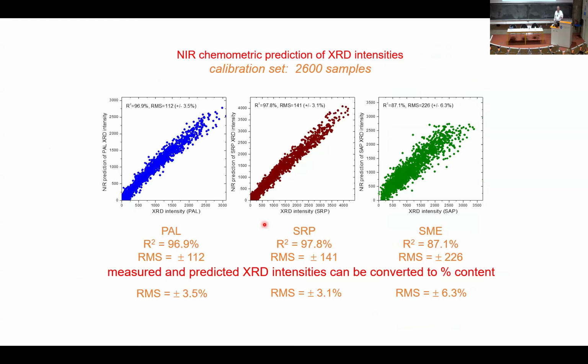You know that the standard way of doing mineralogical analysis of a sample is by XRD. And there are many companies that have an XRD routine to measure the samples and say that much smectite, whatever, quartz, mineralogical composition. And they do that by measuring the intensities of the XRD against some standard. All right. If we take these intensities as independent measurements for the presence of these minerals that are of interest, and we calibrate the spectra against the XRD outcome, then we can make the XRD prediction faster and for more samples.